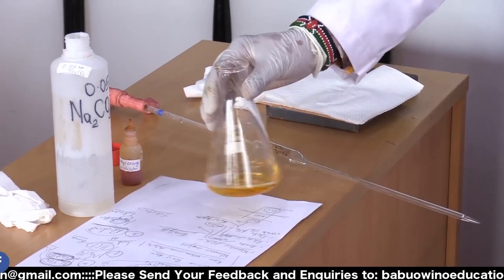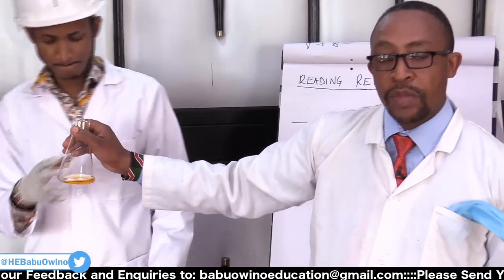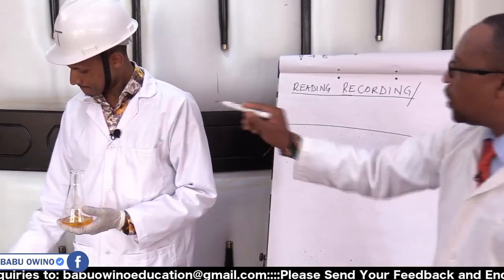So, class, you now see what Mheshimiwa has done. We have a different color here. When this color changes, after running from the burette, we will have the end point. Now, in this case, how do we record that?